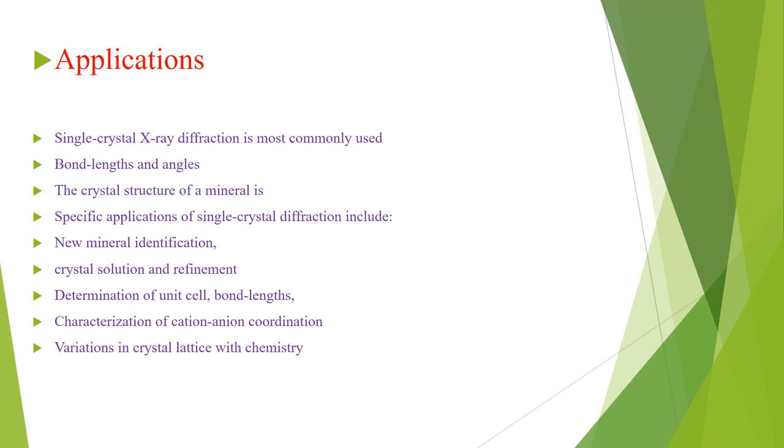Specific applications of single crystal diffraction include the following. Number 1, new mineral identification and crystal solution and refinement. This is one of the applications of single crystal X-ray diffraction. That is, we can identify the new mineral and we can solve the crystal, and also we can refine its structure.